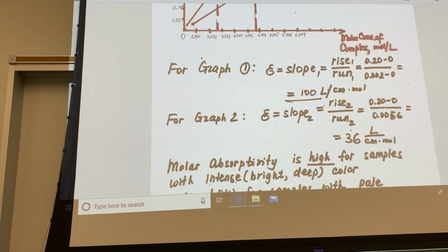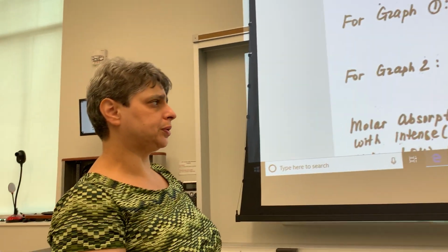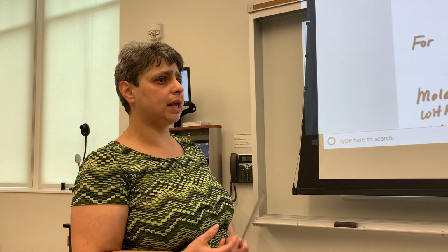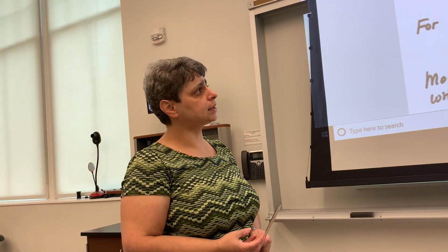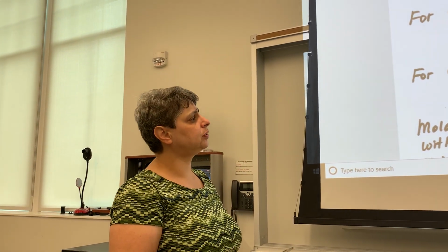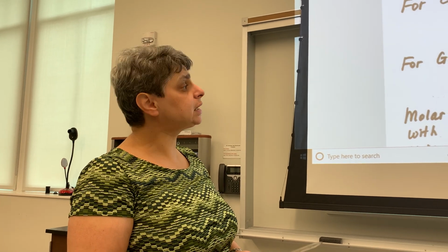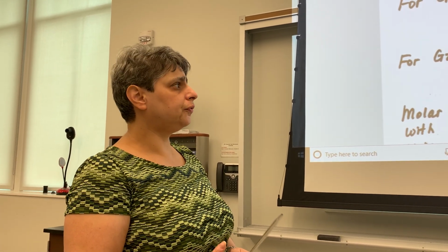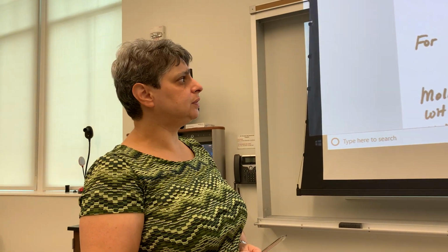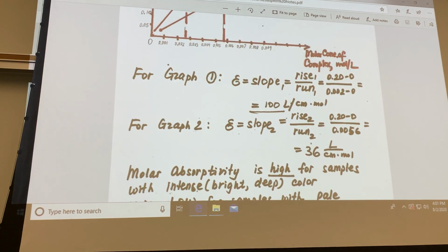And typically your eye can even tell you whether you can expect high molar absorptivity or low molar absorptivity. Basically, if you have a small concentration of solution and yet a very bright, intense color, it might mean that your molar absorptivity is going to be high. If on the other hand you have a fairly high concentration of solution and it's colored but not intensely colored, and the color is sort of faint, maybe would be the term to use, then it means that molar absorptivity would be expected to be fairly low, which is what I summarized for you right here.